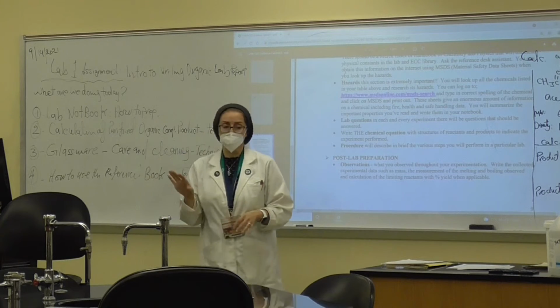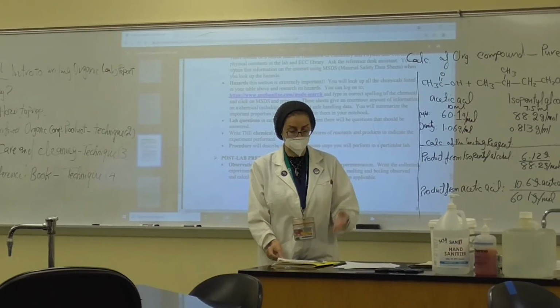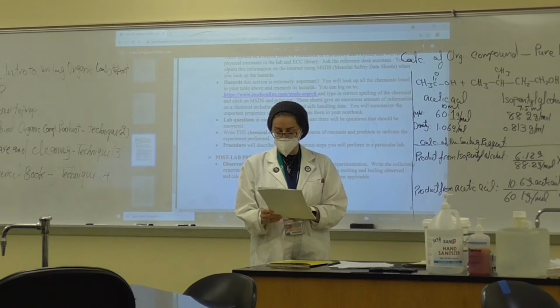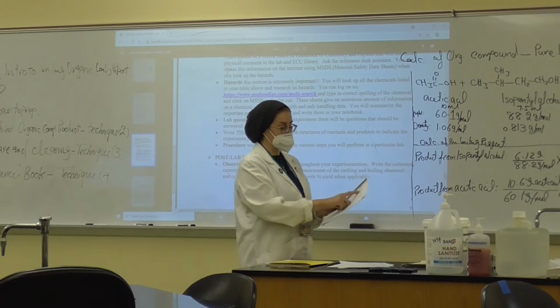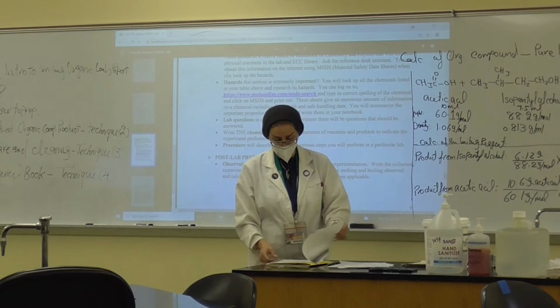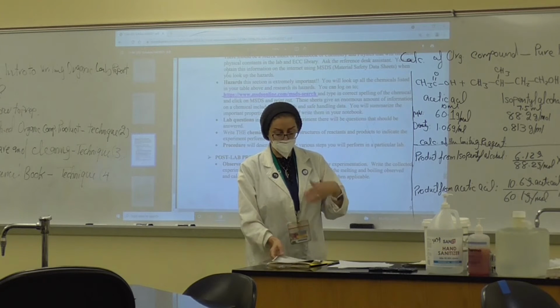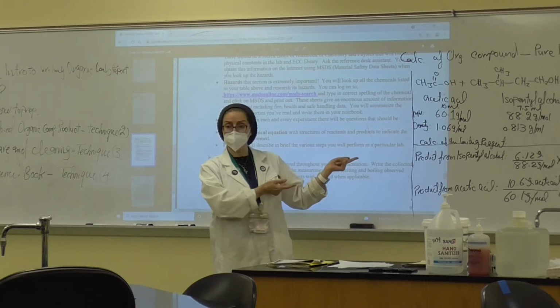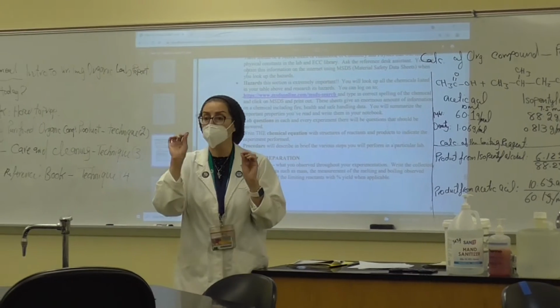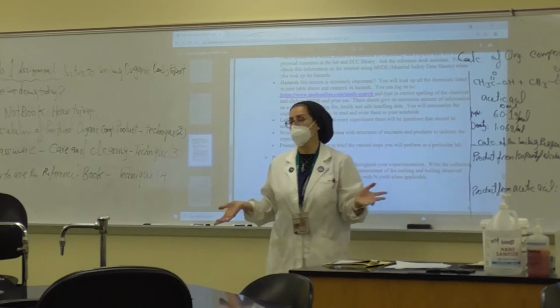All right, so now if you are going to move on, because I did actually try to copy some, because the book is too huge and I cannot even carry it. Go to page number 609, where the lab says laboratory calculation, notebook calculation, and lab records. Then flip to page 610, where they show how we are going to do the calculation and present the percent yield for the pure product. So we are going to mimic this, since they are giving you an example.